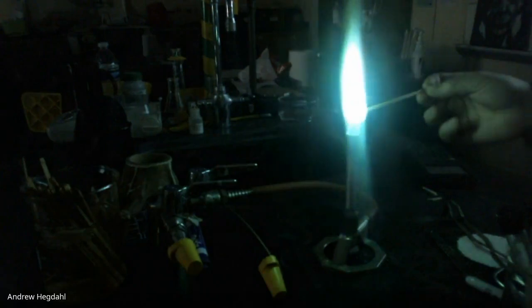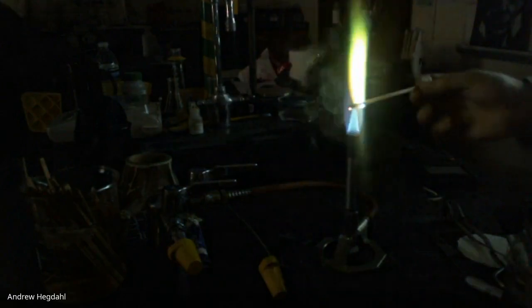D is the one that I demonstrated at the beginning. This gives a really cool flame. This is a bright green color, and then it turns into blue. You can say green, blue, and then you actually get some sparks in here of white. This is green and blue. You get to see it if you don't make it too bright. Brighter orange.